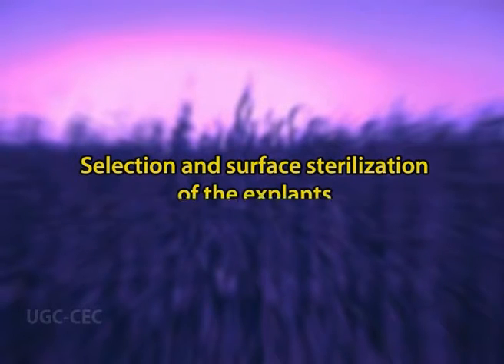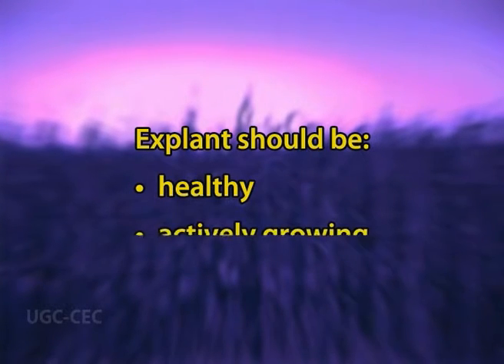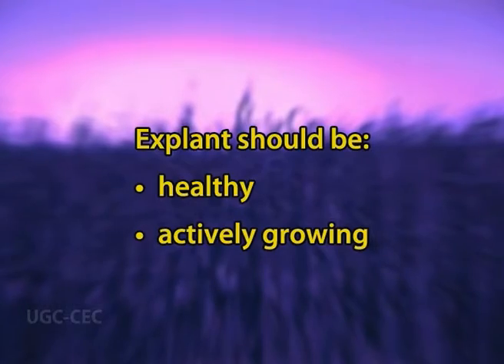Third step in plant tissue culture technique is selection and surface sterilization of the explants. The explant that we use in plant tissue culture should be healthy and actively growing.